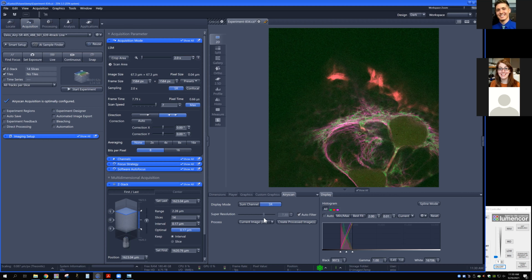And so there are two ways that I can do this. So there's kind of three ways that I can do this. The first way is just with the image, go to this tab, choose whether I just want to do a single slice or the entire 3D volume or every slice as 2D, like as a separate image. So we're going to do the entire thing in 3D, and then I can just hit create processed image.